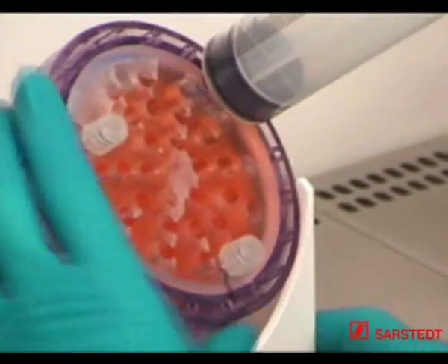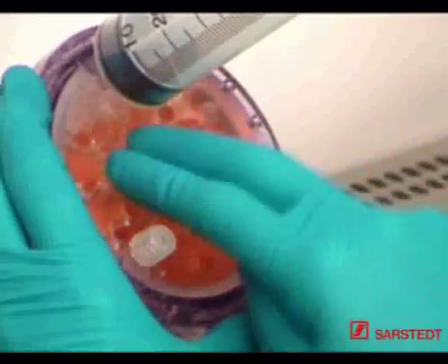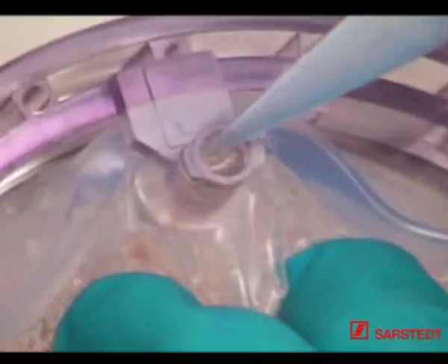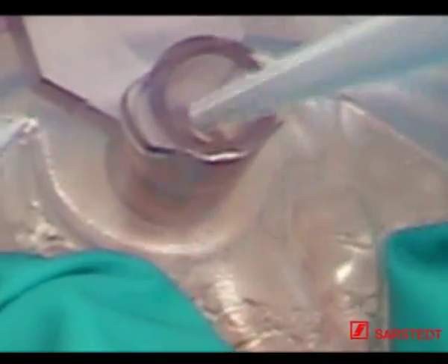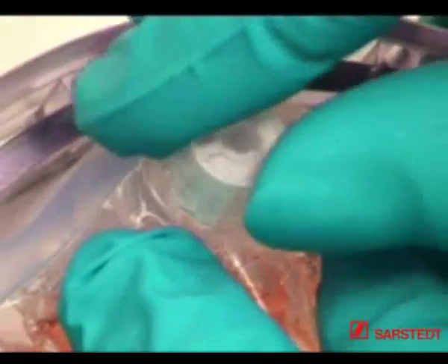Once the cell suspension has been completely dispensed into the production module, fasten the ventilation screw cap once again and rotate the bioreactor until the port to which the syringe has been attached is located at the uppermost position. You can now disconnect the syringe. If possible, remove air bubbles in the production module by lightly pressing your fingertips onto the silicone membrane.